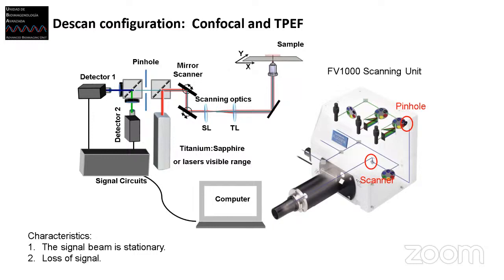It can be any laser, can be two-photon, or can be visible lasers, and then we have an optical element here, a dichroic mirror, which will reflect excitation, right? And then we will have our scanner, and then some optics. And this optics is important to basically scan our light across the field of view.